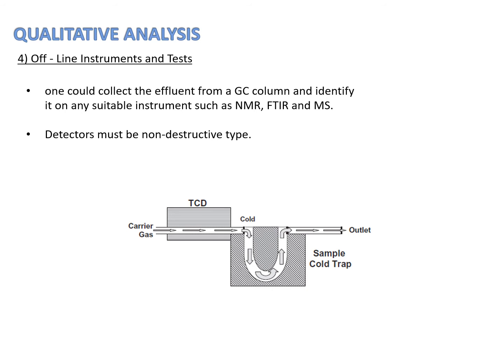Detectors must be non-destructive type, because if our detectors are destructive types, usually we can't get the sample. Our sample will go into the waste bottle, and we can't use the sample anymore. If our detectors are non-destructive, we can get the sample back. Something like that, class.